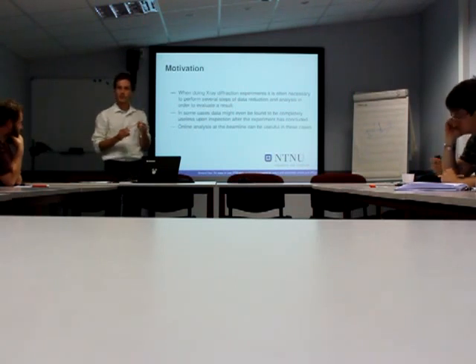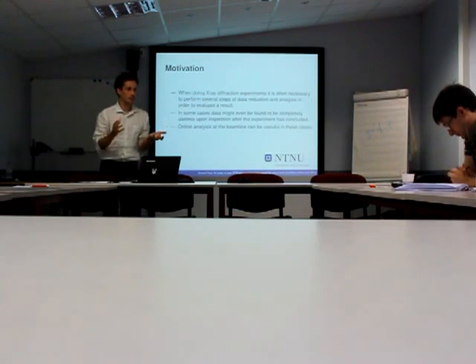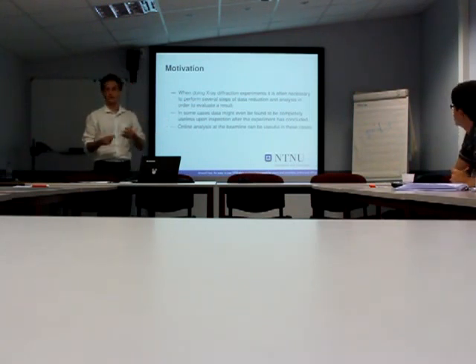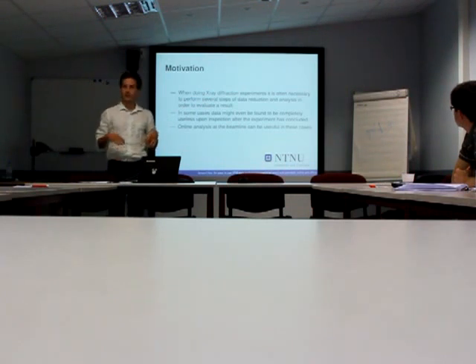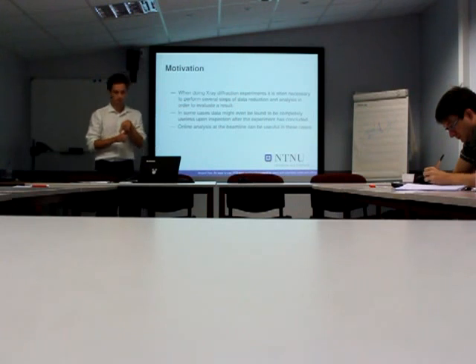And in some cases, the data might be bad. You have some sample that doesn't diffract well, or something like this. And if you discover this after the experiment is concluded, it's failed. So in these cases, online analysis on the beamline while you're doing the experiment can be very useful.